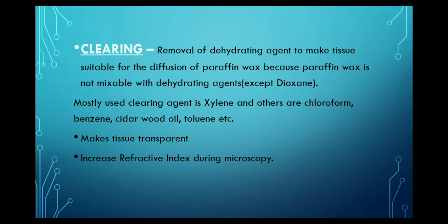Dioxane is a dehydrating agent which is miscible with both water and wax, but others are not, so we have to remove the dehydrating agent by using the clearing agent, which are miscible in paraffin wax. Clearing agents are xylene, toluene, chloroform, benzene, cedar wood oil. Clearing makes the tissue transparent, which increases the refractive index for microscopy.